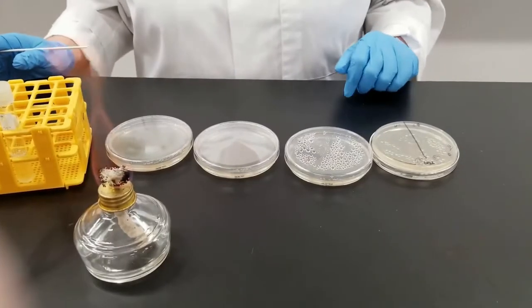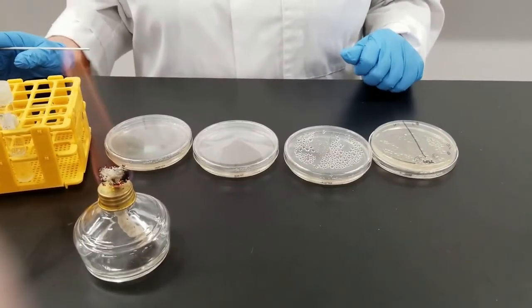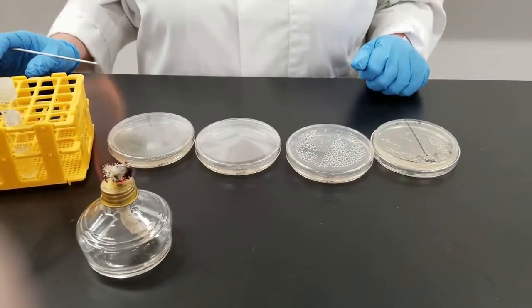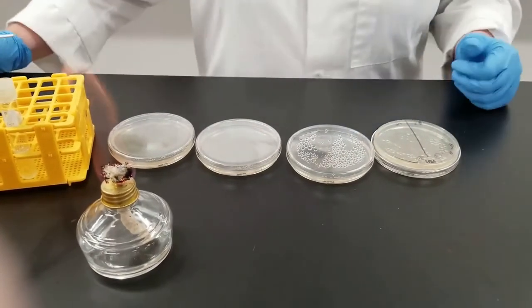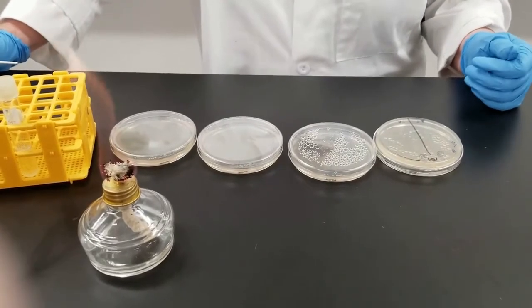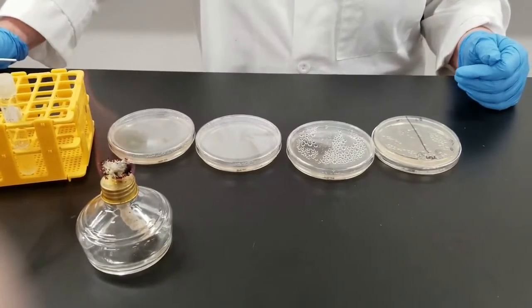Okay, we're going to be looking at the effects of UV light on organisms. We're going to be looking at two different organisms, Staphylococcus aureus and Bacillus subtilis. Both of those are gram-positive organisms. Just to let you know, Bacillus subtilis is a spore former.